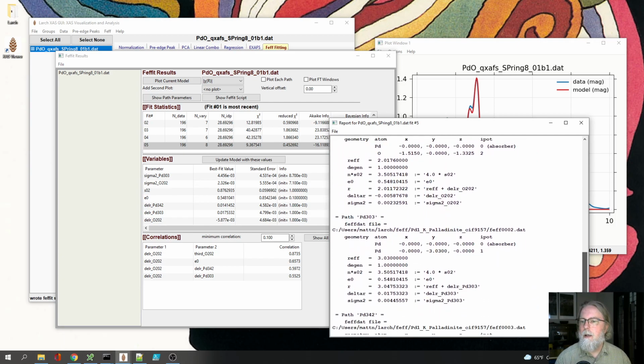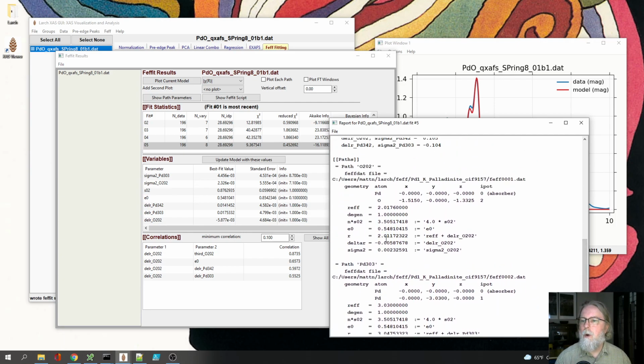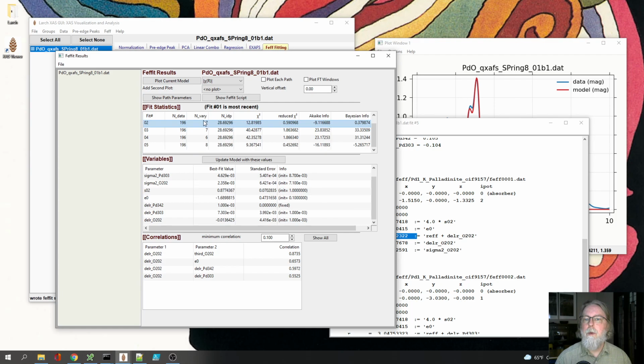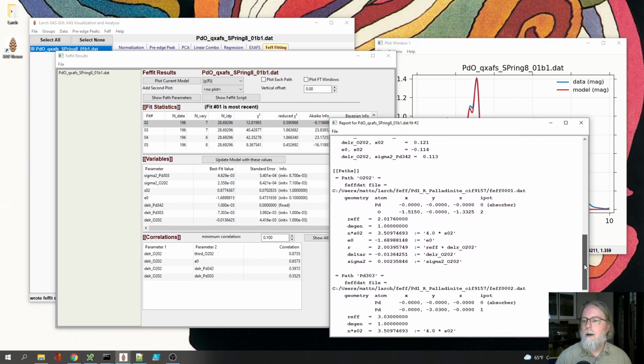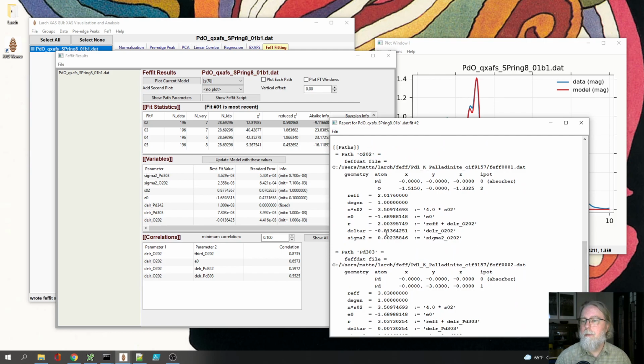It was 2.01. So it dropped by a hundredth of an angstrom when the third cumulant was included. So here delta R was minus 0.005, and with the third cumulant competes with that, but now it's a full picometer refinement lower in distance.